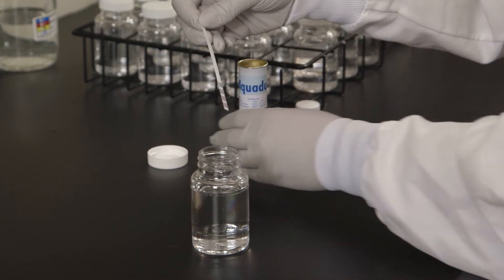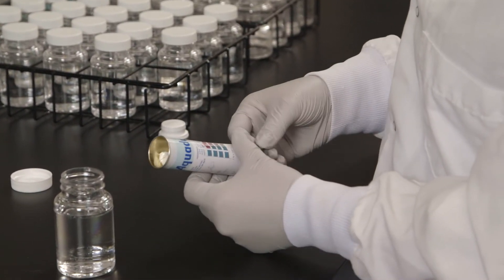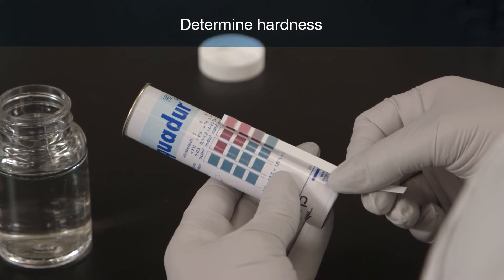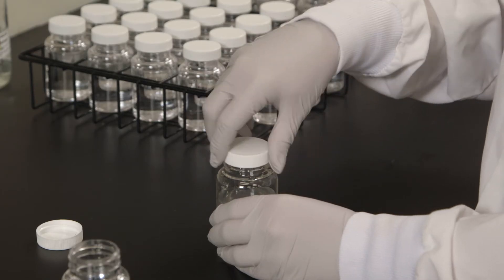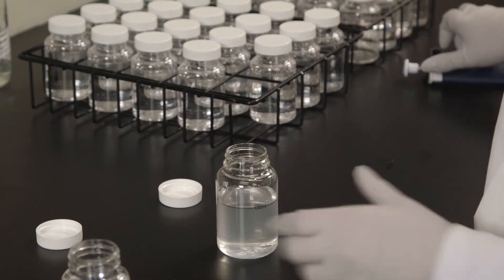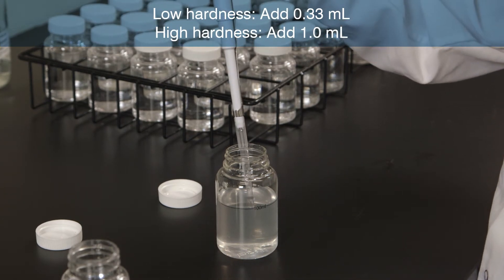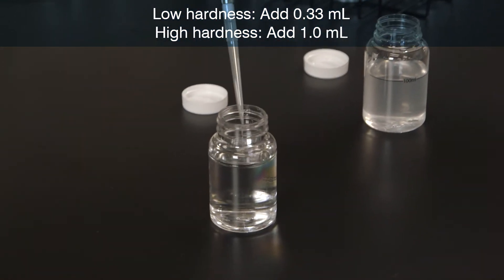Measure water sample hardness by using the hardness dip strip supplied with the supplement kit. Follow the manufacturer's instructions. Determine whether the sample is of low or high hardness. For low hardness samples, add 0.33 ml of supplement. For high hardness samples, add 1 ml of supplement.